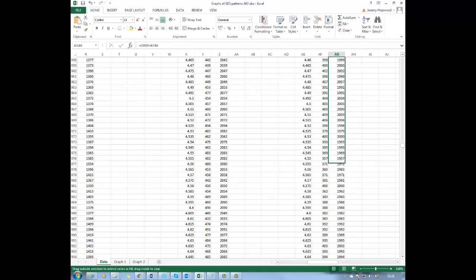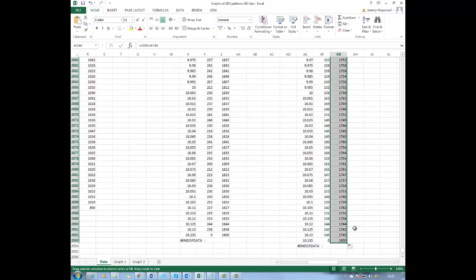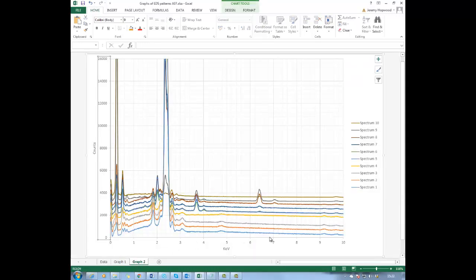It might seem like a lot of effort, but you do end up with a graph which, if you wanted to, you could publish without changing things too much. So now we've done number 5. Number 6 has disappeared, you can't see it. Number 6 means offset by 400. So what I'm going to do now is offset them all. When I get up to the brown one, number 8, the one after that I'm going to offset by 800 instead of another 400 because the lines are so close to each other.